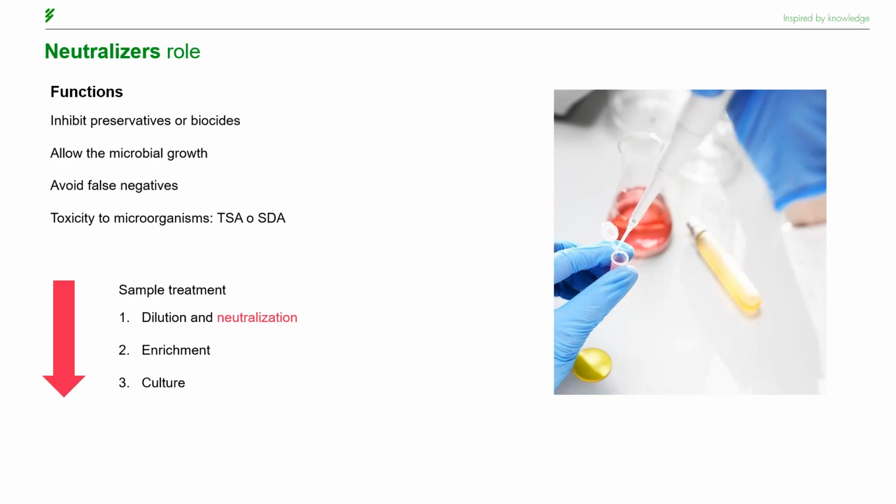That is why the use of neutralizers in these diluents or enrichment media is essential, so that they inactivate a preservative or biocide and at the same time allow the free growth of microorganisms. If a biocide or preservative is not inactivated, we can easily overestimate its antimicrobial capacity, because its activity would continue even during dilution or enrichment.